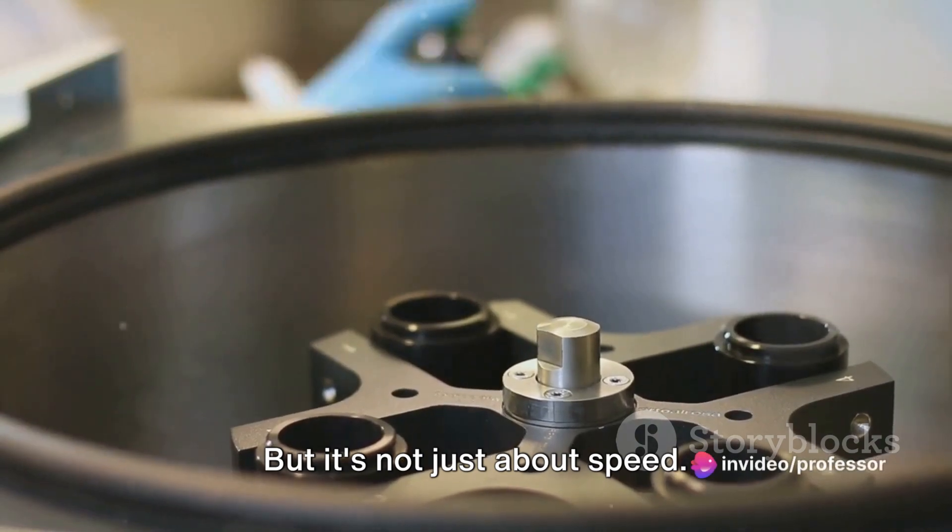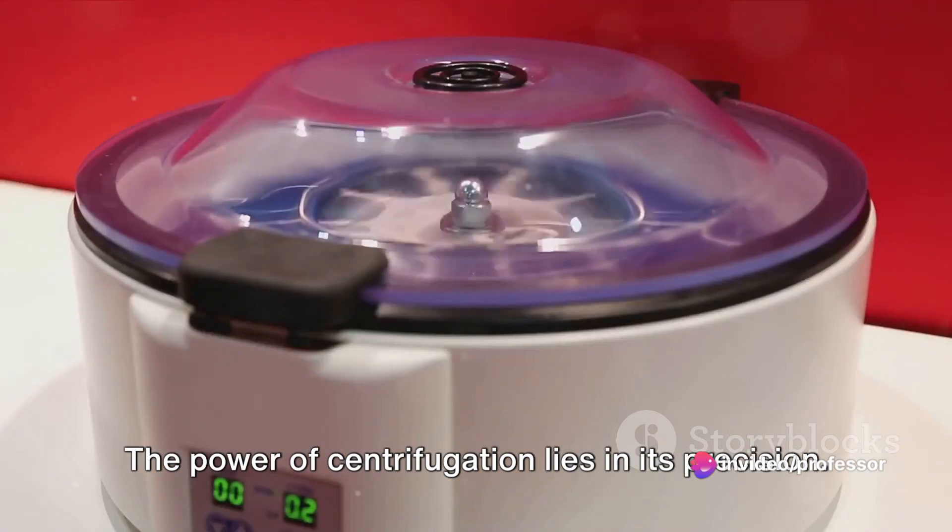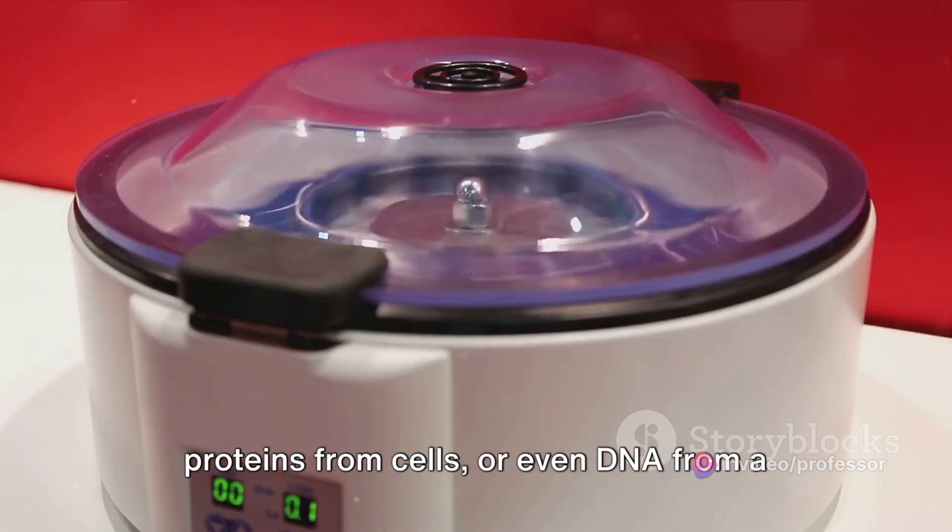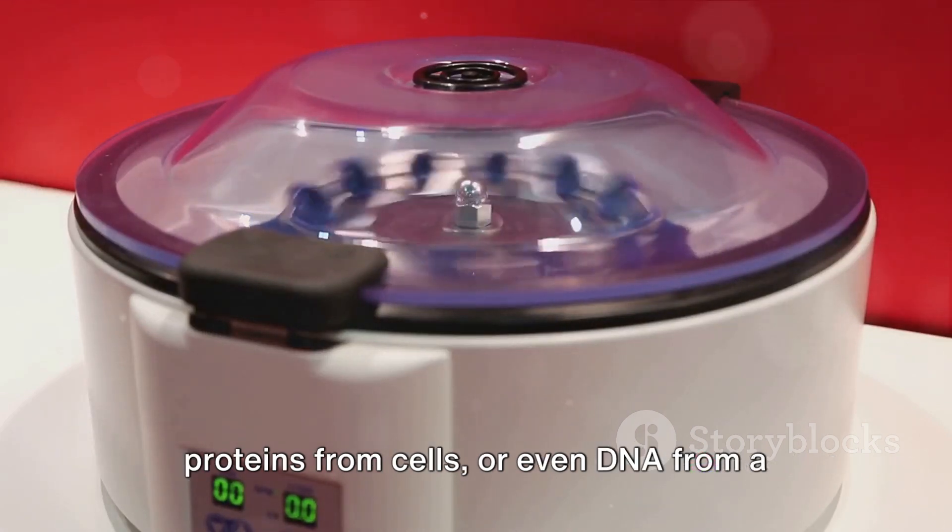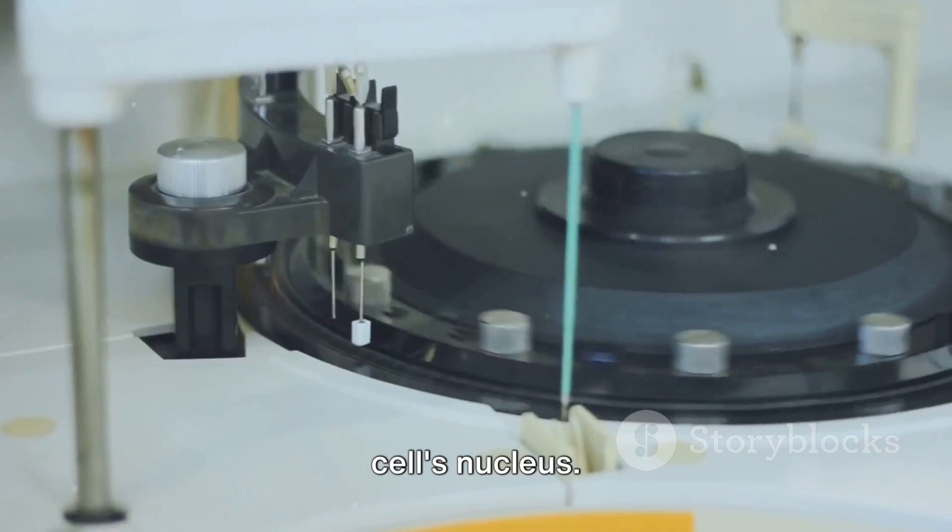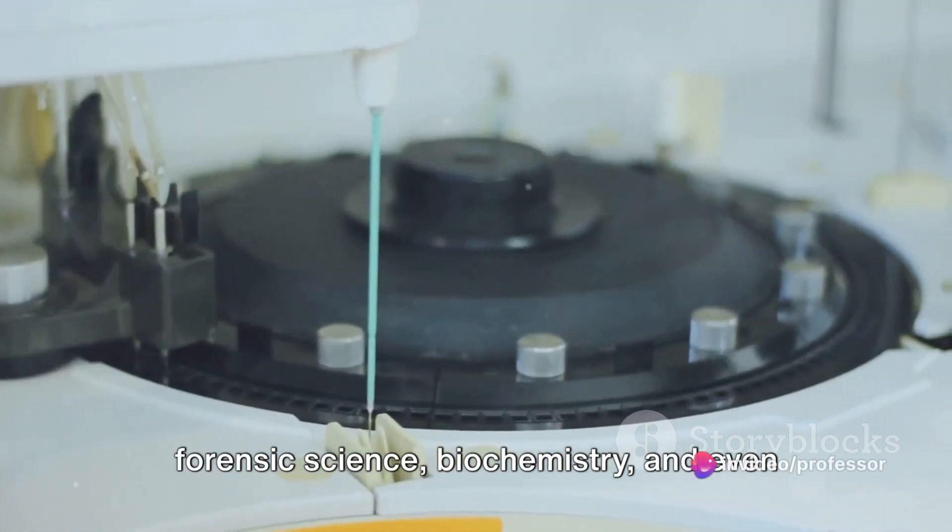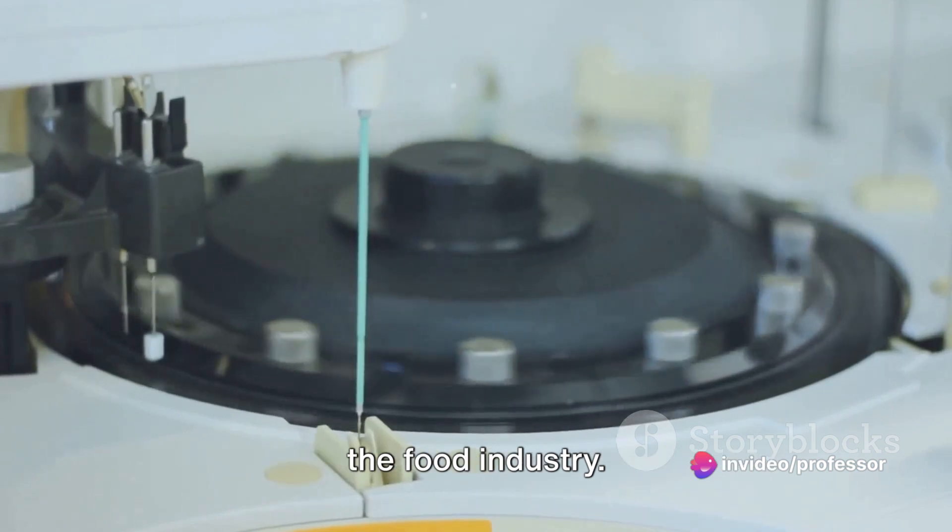But it's not just about speed. The power of centrifugation lies in its precision. It can separate cells from a liquid, proteins from cells, or even DNA from a cell's nucleus. It's a vital tool in medical research, forensic science, biochemistry, and even the food industry.